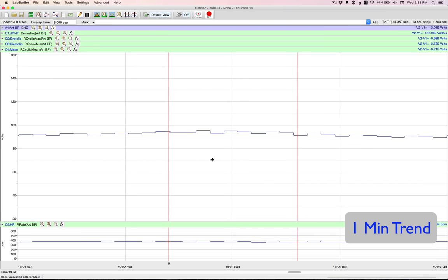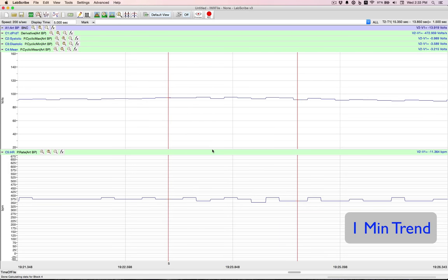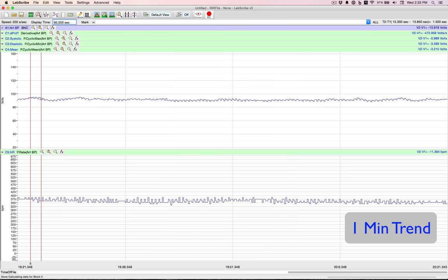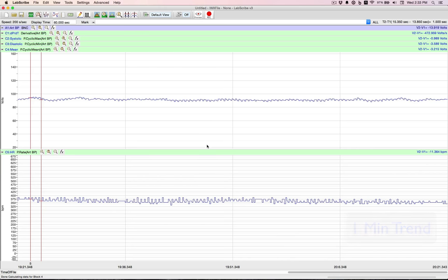And with that, I now have my mean and my heart rate exposed. I've got to change my display time. Change our display time to 60 seconds. And now we're displaying a 1 minute trend.